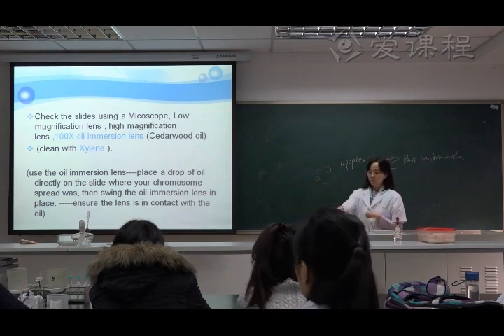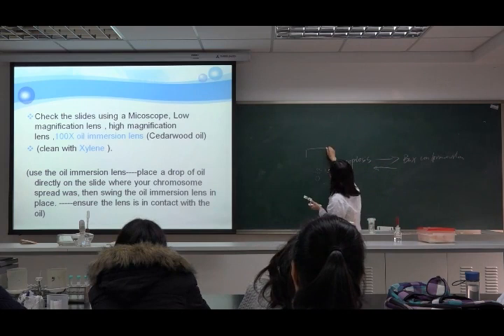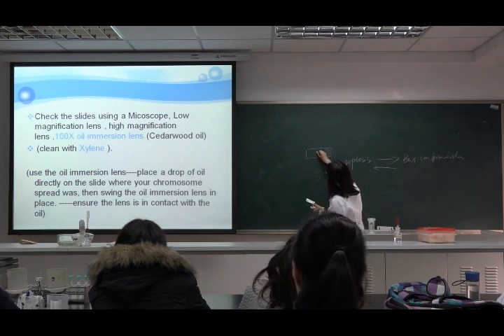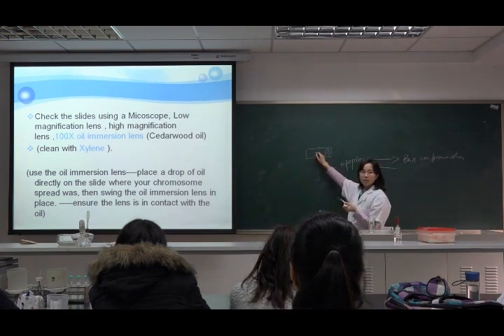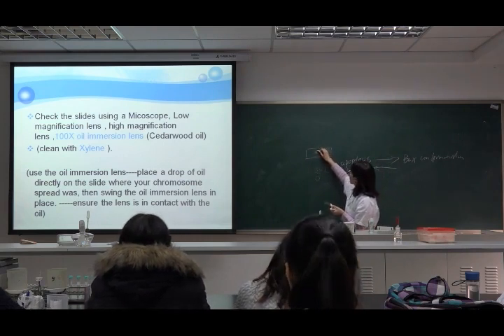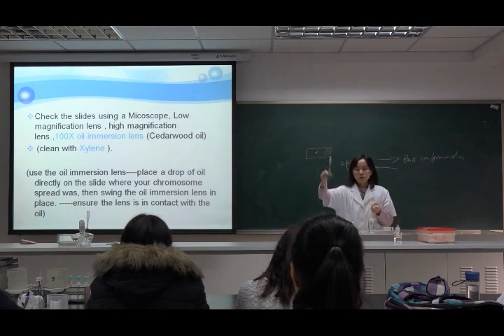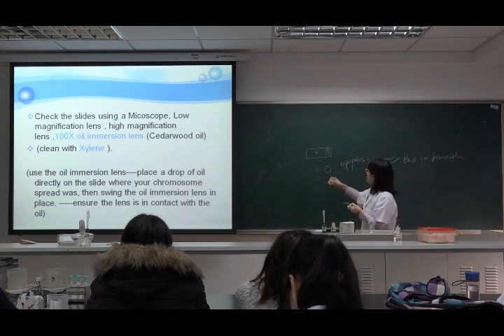This is our slide. You observe one chromosome spread here, a metaphase spread here. Then you drop one drop of oil here. This is the oil; you put the oil on your slide.